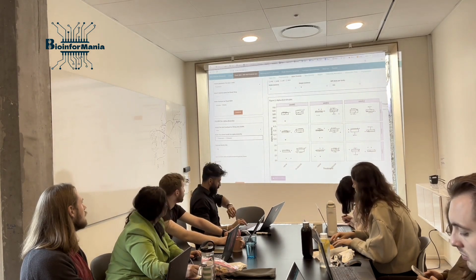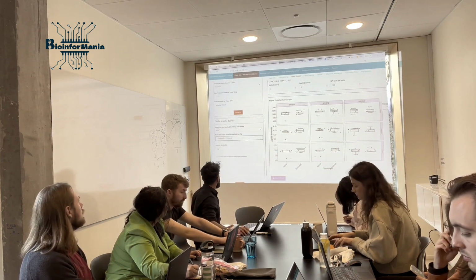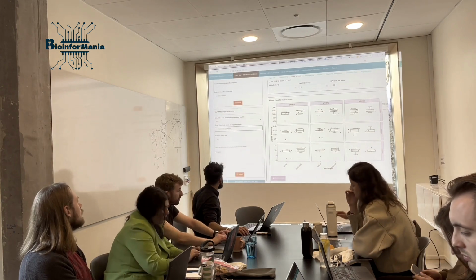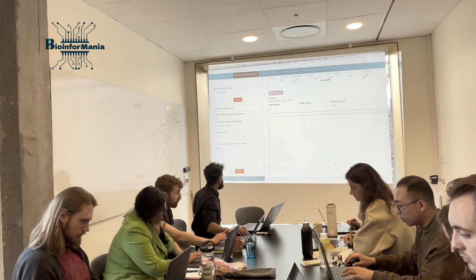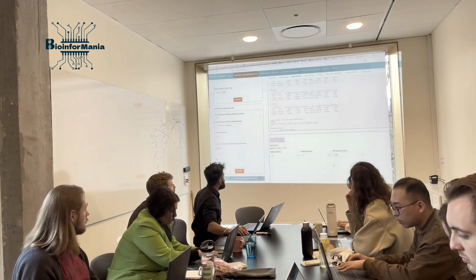I think we are running out of time. Let me speed up. So in this case, this one will be ignored. The rest of this will be ignored. You just click fit model and see what happens down here. Give it time. Okay, great.